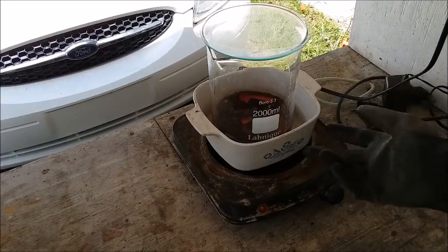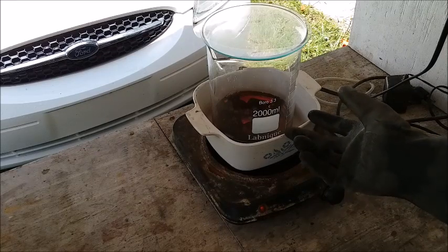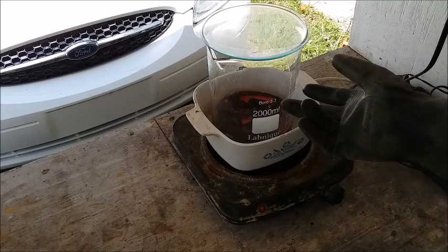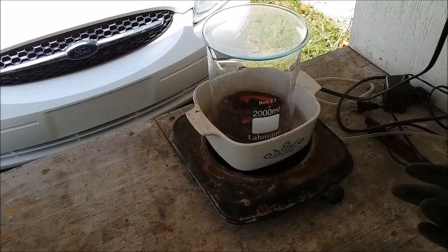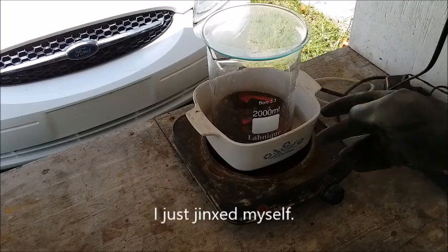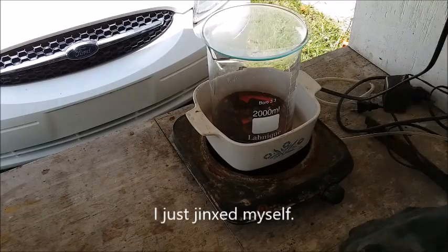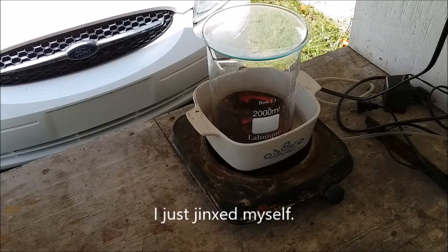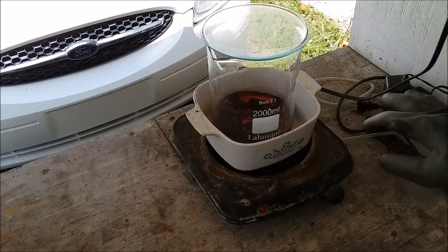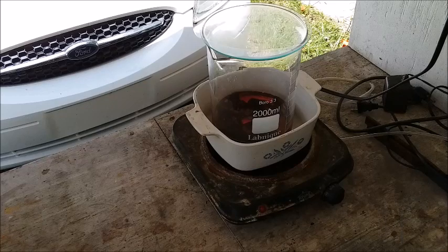And it's in a big beaker because the carbon foam that's going to be created as the sulfuric acid digests the epoxy can pop up quite a bit, and I don't want it flowing over. One thing you can do when that happens is just pour more sulfuric acid in it to beat the foam down. It's going to need several applications of sulfuric acid to digest all that stuff, and it's going to take a while. Probably the better part of the afternoon to fully digest all that stuff. So I'll show you from time to time what it looks like.